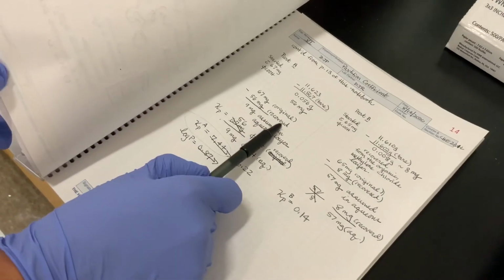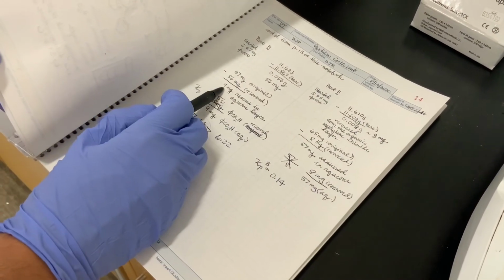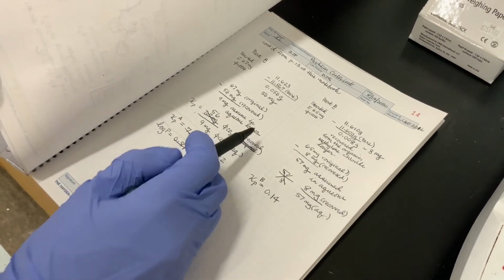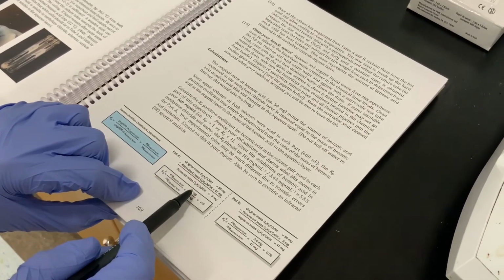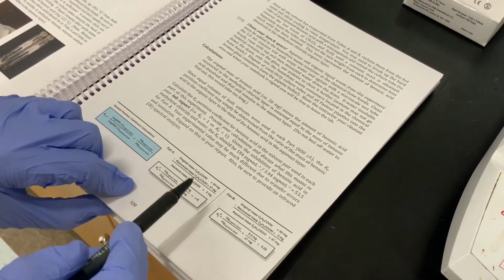So the amount that we recovered was 56 milligrams. And so we can assume that 9 milligrams of the benzoic acid remained in the aqueous layer. Okay? And so now to calculate the partition coefficient, we take the amount recovered divided by the amount assumed in the aqueous layer.